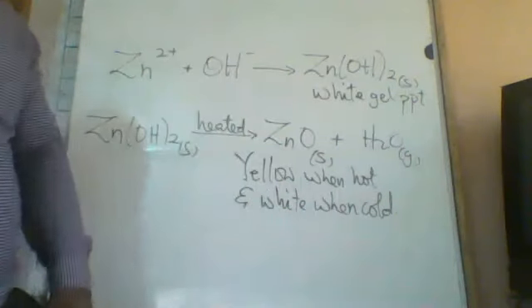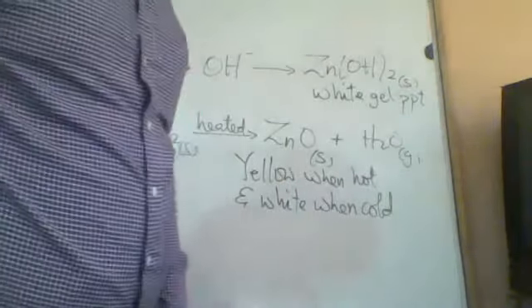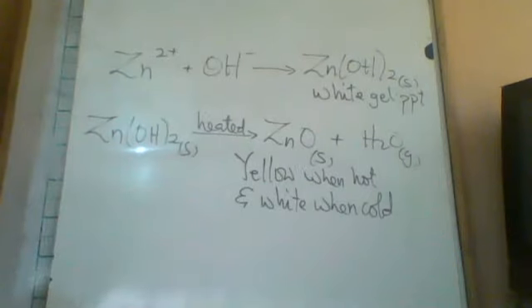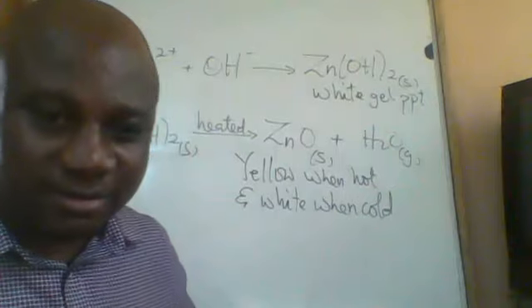So with this, we will be able to confirm that the substance in question is zinc ion. That's the confirmatory test for the zinc.